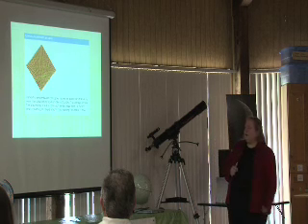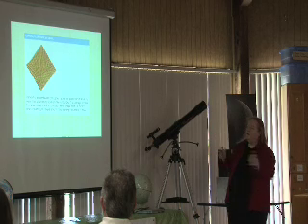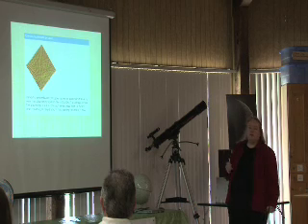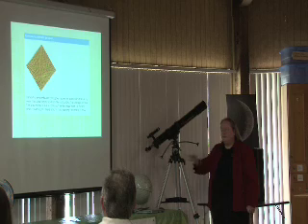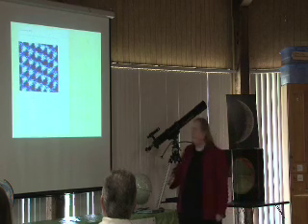This is a dendritic. It's just a pretty fractal array. It looks like trees or branches growing out. This is copper that was grown on a glass surface. And it's just another pretty image to take a look at to see what things look like. If you have something flat, you can put it on an AFM and you can see it.